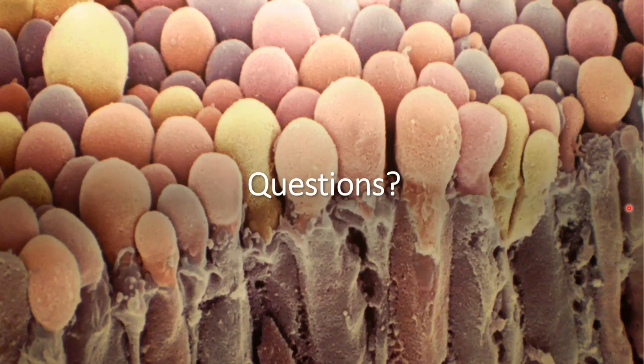And in case you're wondering, again, these cells are the cells that secrete the gel that holds your brain together to stop it from collapsing in on itself. They're called the choroid plexus layer. Okay, I'll carry on then.